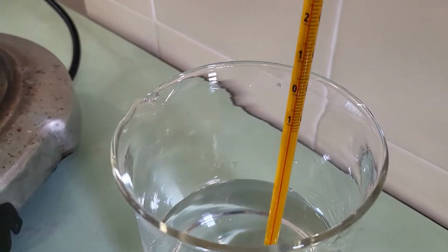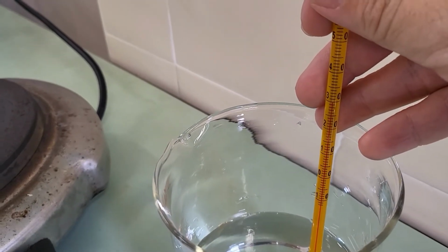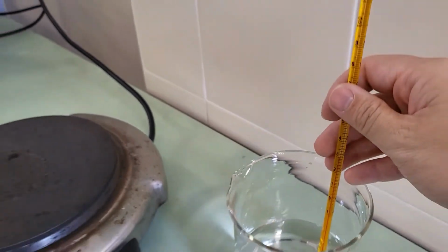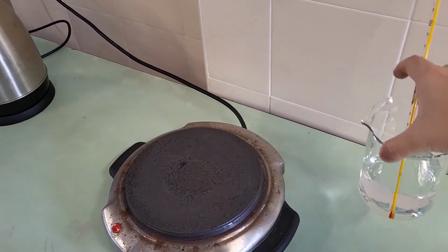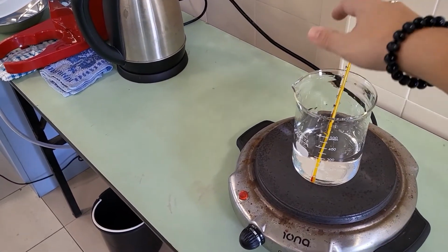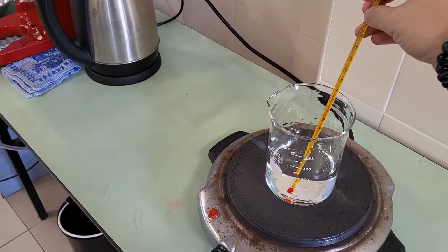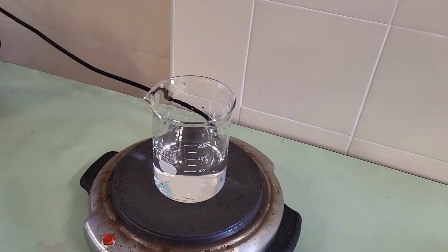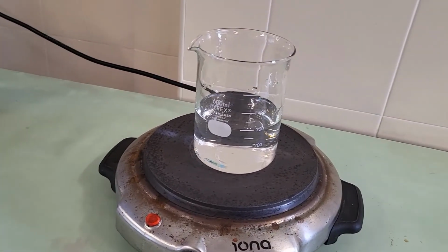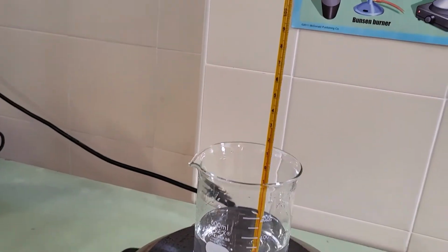If we do a close-up, you would see that the temperature of the water is approximately 29 degrees Celsius. Now we're going to put this beaker onto the heating tray and see what the temperature is like. We'll come back to measure it in a while. It's been a while, let's see what our temperature is like. As we can observe right now, the water is still not boiling, so let's put our thermometer in to take a look at the temperature.